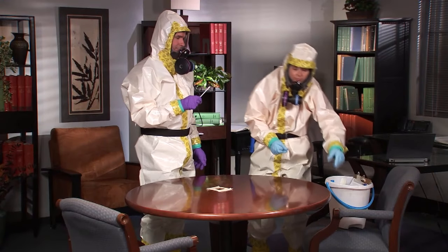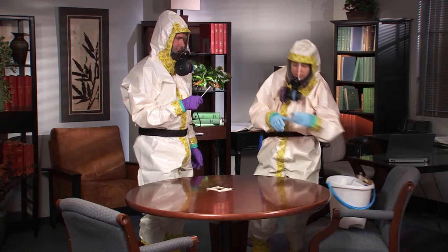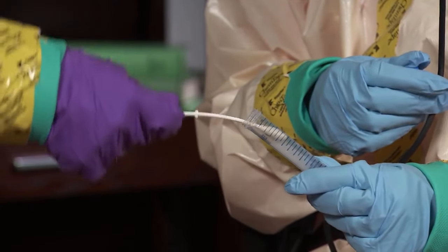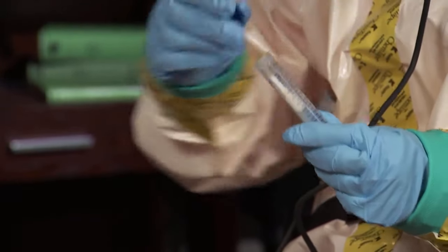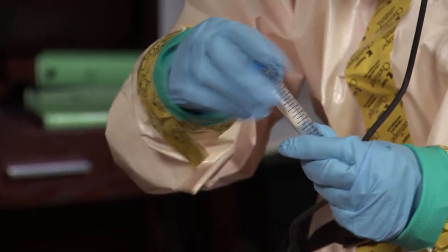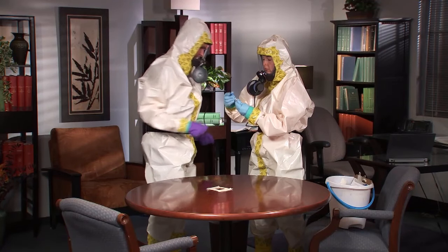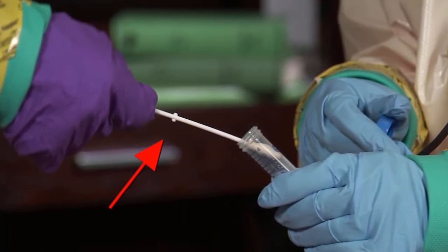After the area has been covered three times, the sampler places the swab into a screw cap tube so the sampler can break off the head of the swab by bending the handle at the score. The sampler should not touch the tube or insert the handle of the swab beyond the thumb stop.